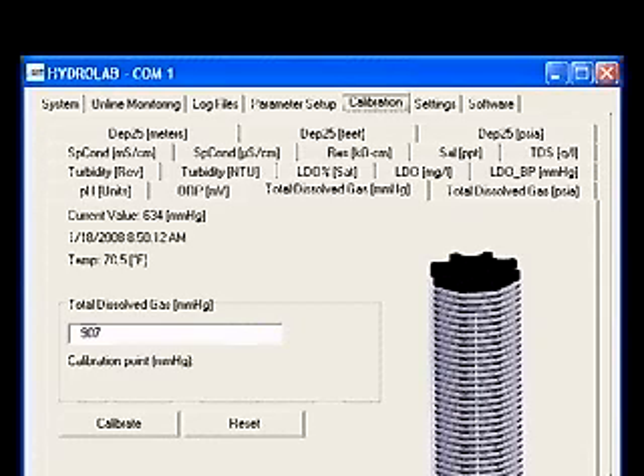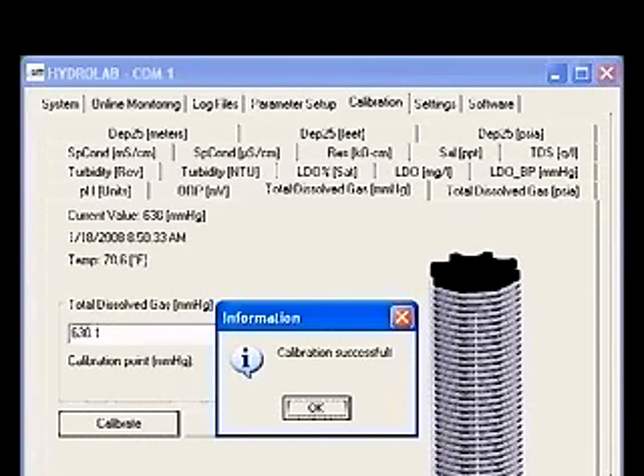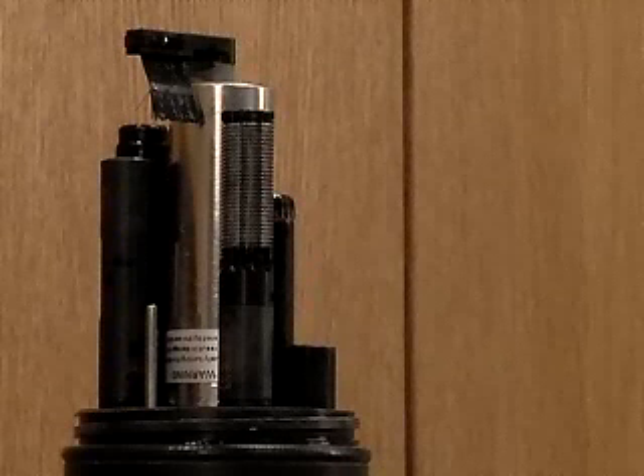You will see a picture of the TDG probe, the current value in the units selected, the date and time, and the current temperature. When the current value is stable, type the actual barometric pressure into the box and click the Calibrate button. A calibration successful message will appear. The TDG sensor is now calibrated.